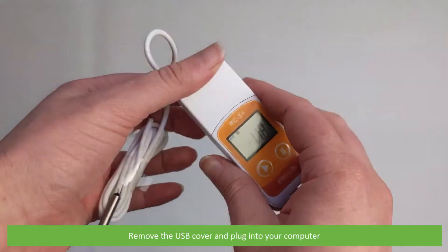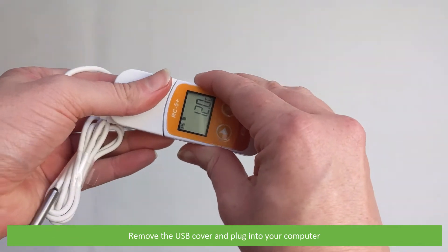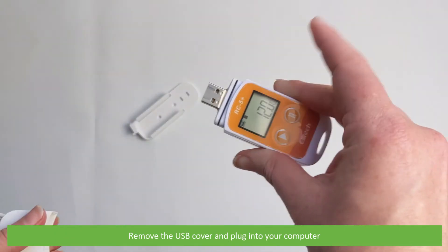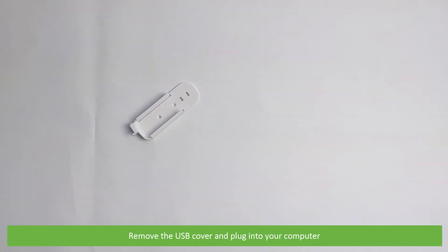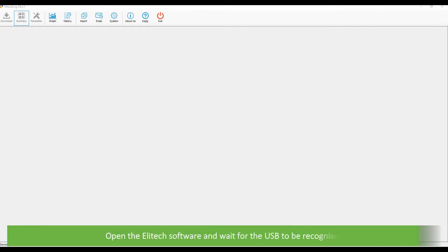Remove the USB cover and plug into your computer. Open the Elitech software and wait for the USB to be recognized.